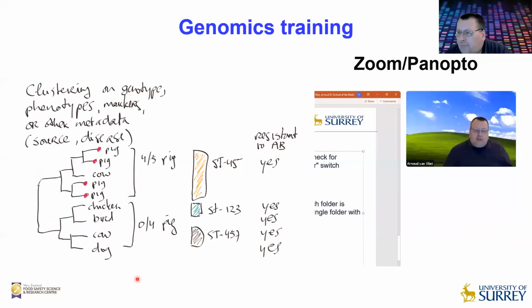And then they get me talking in like 20 to 40-minute videos, several of them, about the different aspects of how to make phylogenetic trees, how to do antimicrobial resistance analysis, and all these kind of things, and includes my bad drawing on a tablet. But it basically means that everybody can do it at their own speed and at their own computer.